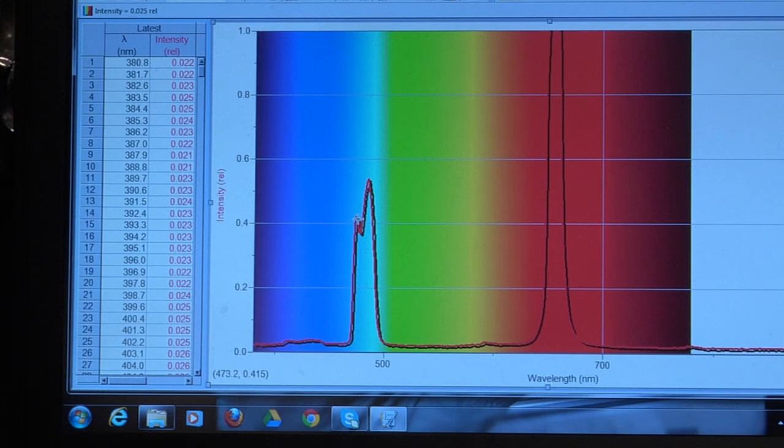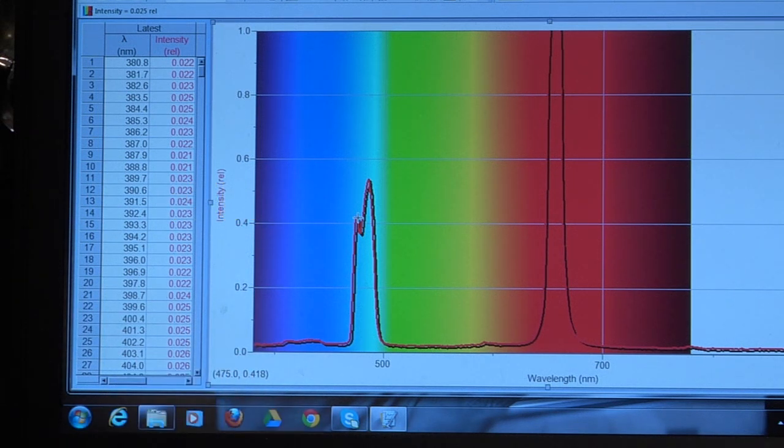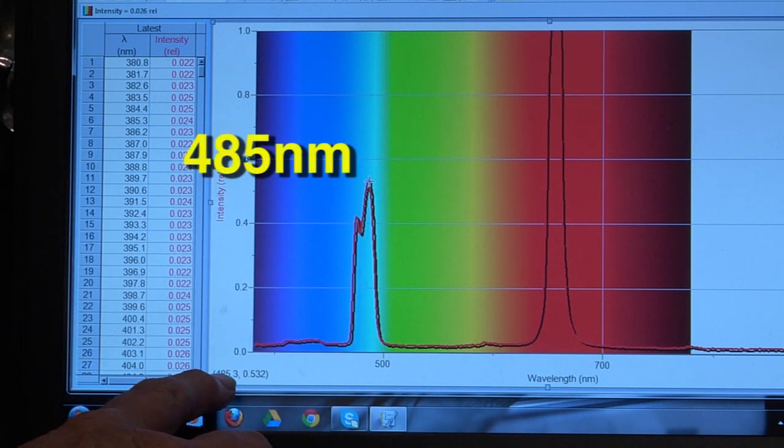If we move our cursor right to this first peak, you can see that it's approximately at 475 nanometers. If we move to the second peak, you can see that it is 485 nanometers. So that's the wavelength.